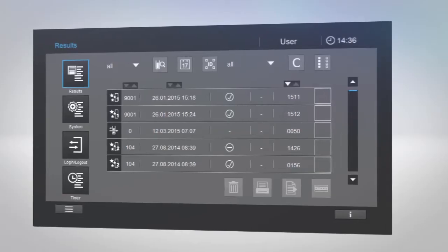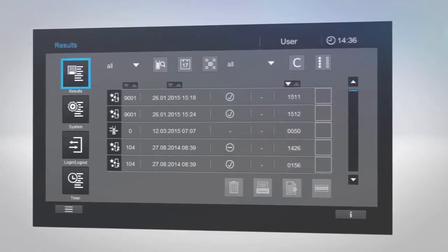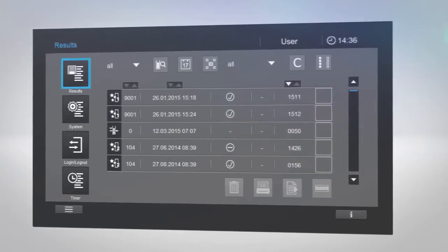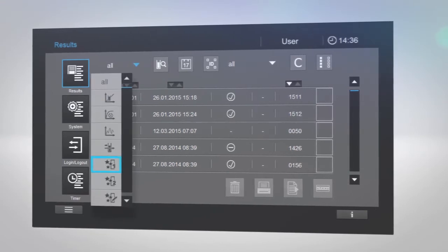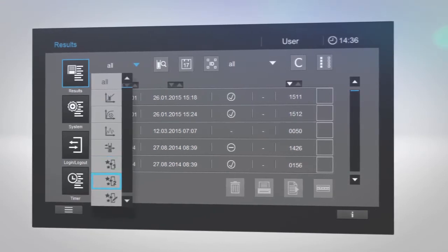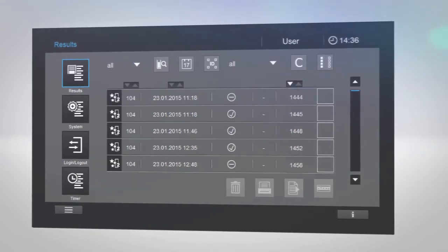All AQA measurements can be accessed in the results list, where you can select AQA1 or AQA2.